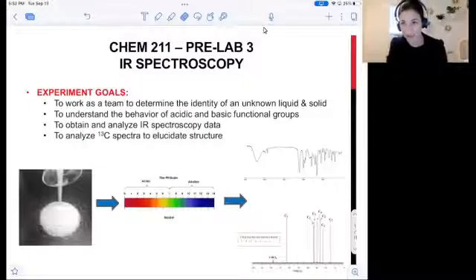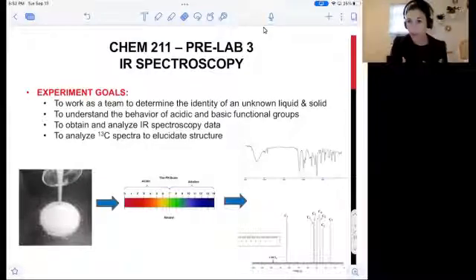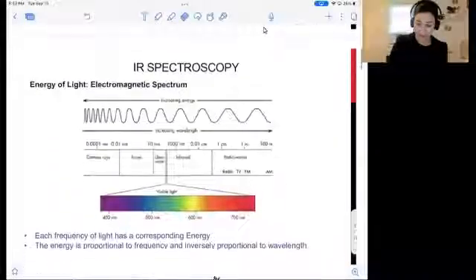Welcome back. In this video, we're going to talk about how we can use infrared spectroscopy to confirm the presence of functional groups within our organic unknowns.